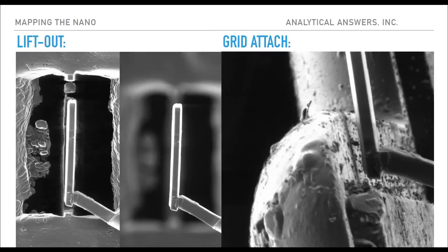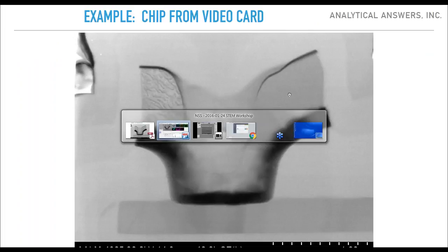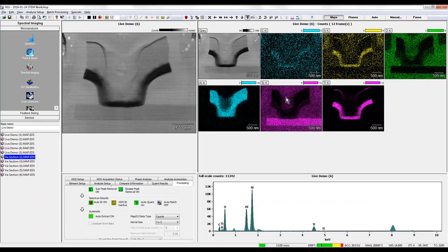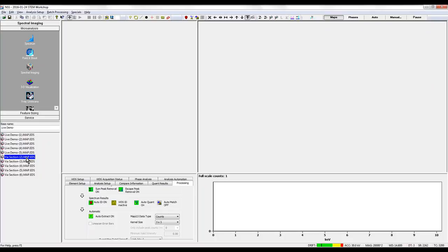And how significantly depends on just what elements you're looking for, and also it depends on how sensitive you need the analysis to be. So this map has now been running for 2 minutes, and while the picture is not bad just from an eyeball's perspective when seen small, if you were to try and extract any quantitative information from this, it would be difficult. So because of that, I have actually collected the maps for these samples ahead of time. And the maps that I collected, I ran for a total of 15 minutes.